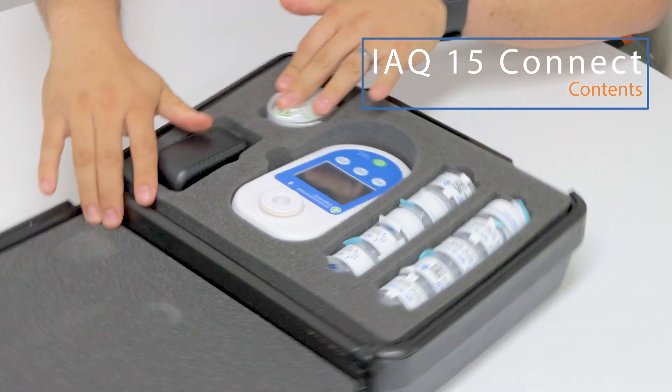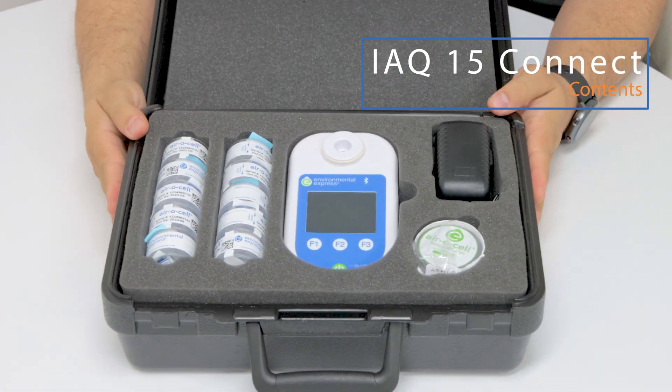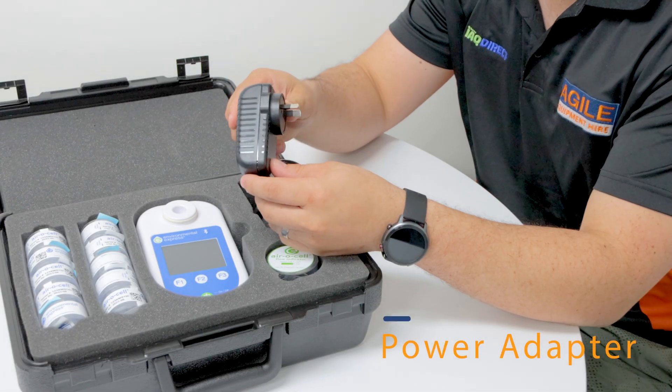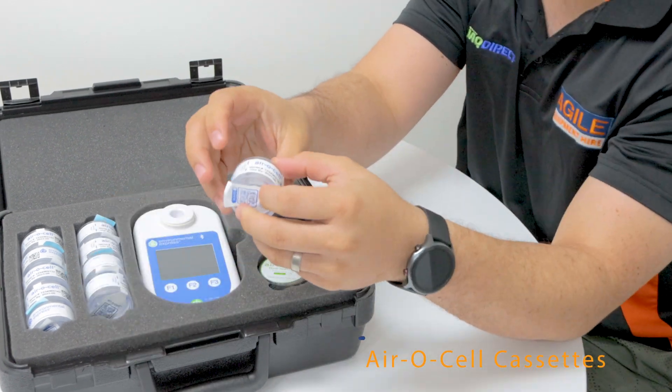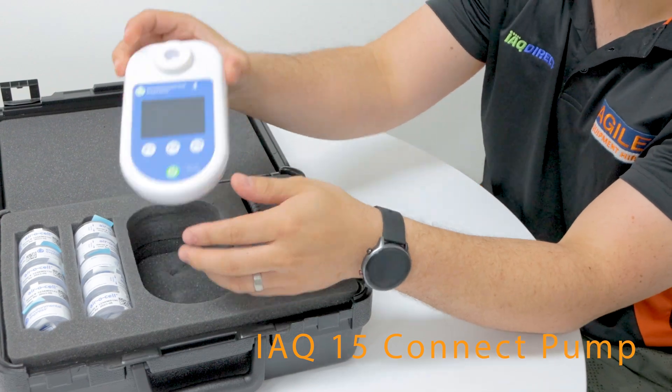The IAQ 15 Connect comes in a ready-to-go hard case which contains the following: a power adapter, an Air-O-Cell airflow indicator, 10 Air-O-Cell cassettes, and the IAQ 15 Connect pump.